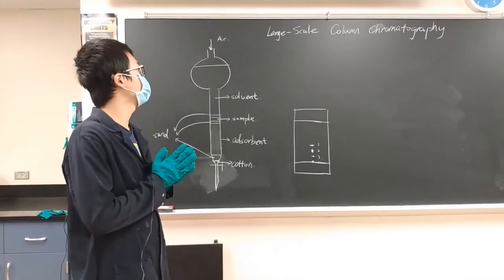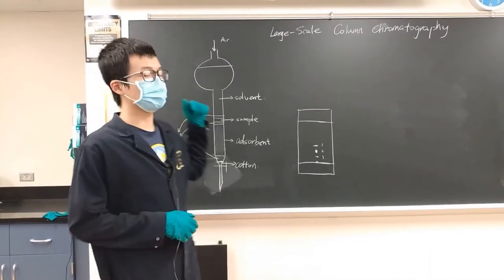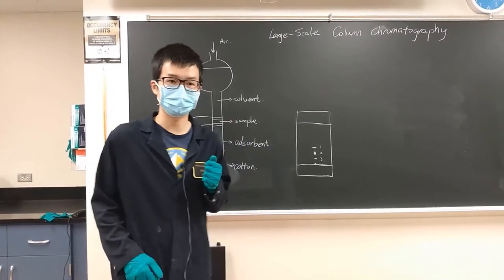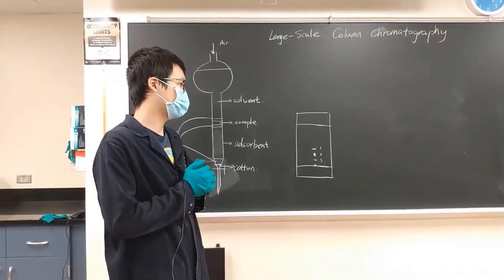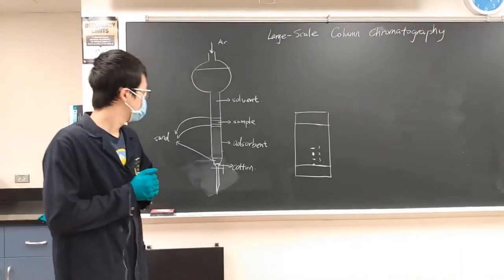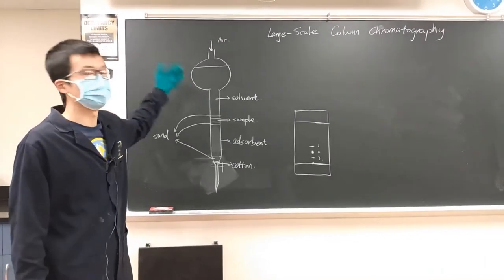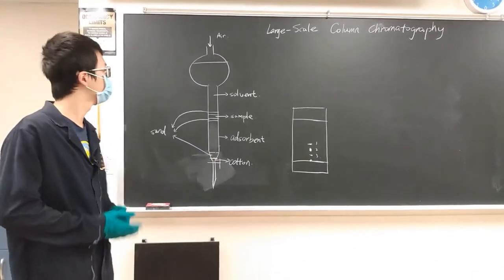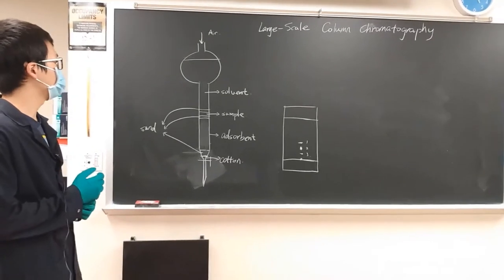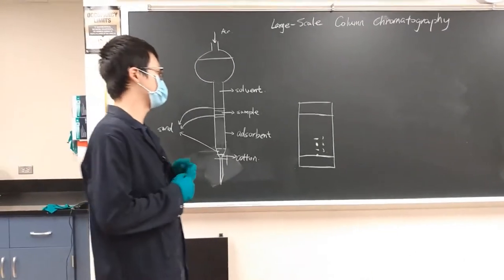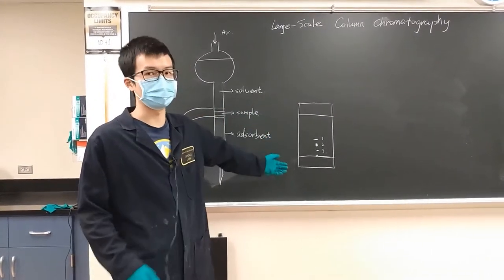All right, so today we're going to do large-scale column chromatography to purify a mixture of pigments. I'm going to briefly introduce how this huge column works. The basic theory is exactly the same as TLC.